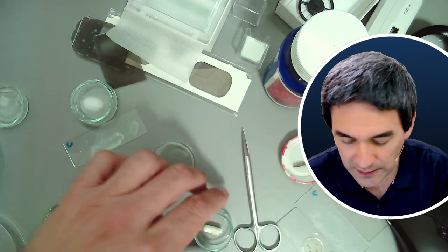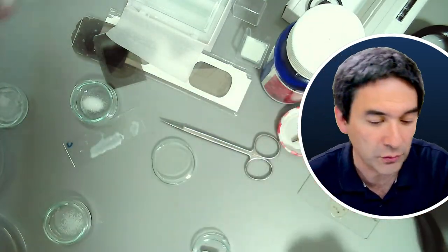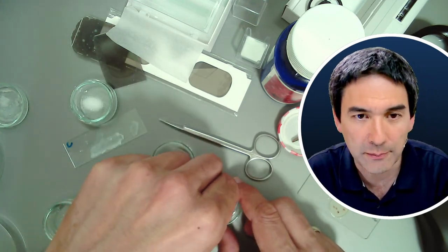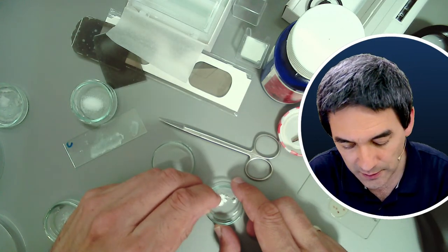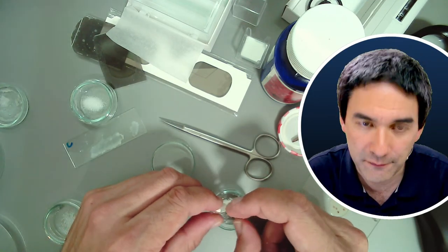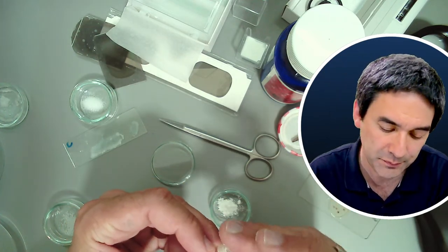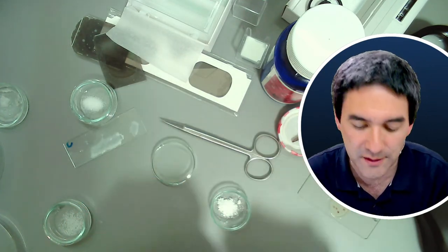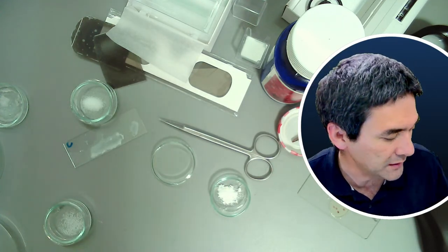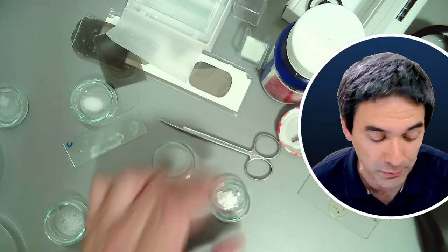So what I have here, and again, this is not the first time that I'm doing this, so some of you who have been watching my live streams and some of my videos have already seen this before. Some of you may not, but what I've got here is a little capsule of caffeine. I simply pressed out some of this powder. This is not pure caffeine. If you read the ingredients, it also contains a lot of cellulose, which is a filling substance. I bought this just for doing some crazy experiments with water fleas, because they do respond to caffeine. I'm not eating caffeine.